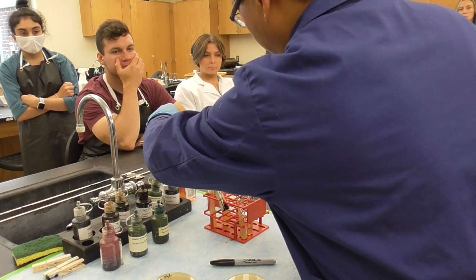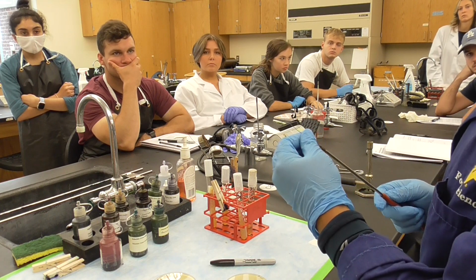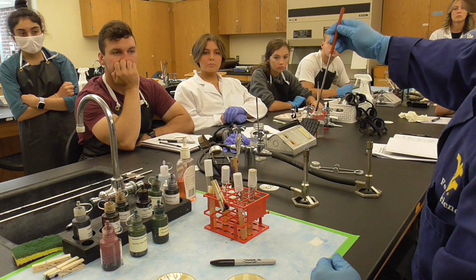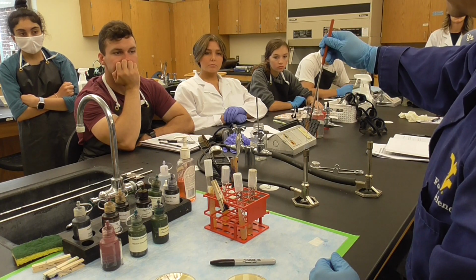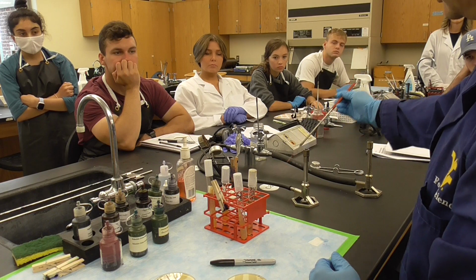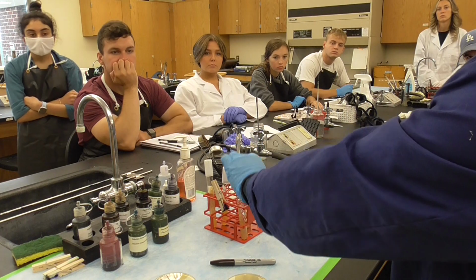Okay, first thing is the same. Make sure your loop is straight. So you can use your hands to make sure this loop is straight. And the flame. Flame the loop. Let's do these one by one. Flame these a little bit. Let's do the easiest one, the plate.